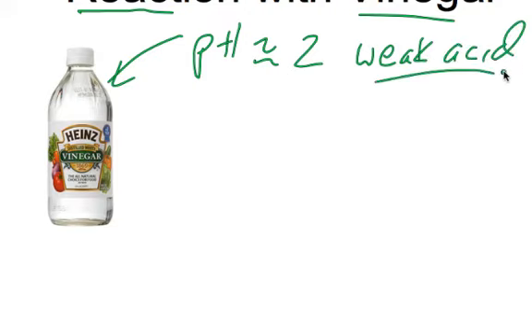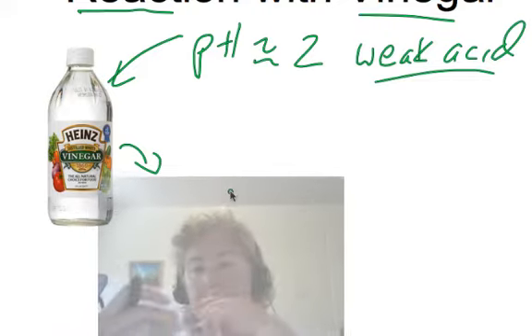Okay, it has something to do with not how low the number is, but the chemicals which make it up. And later on we're going to find that it's actually an organic acid. We're going to see what happens with these particular powders. And what we're going to do is you're going to use a beaker. And this is your famous beaker.